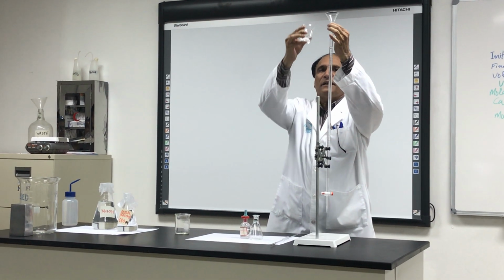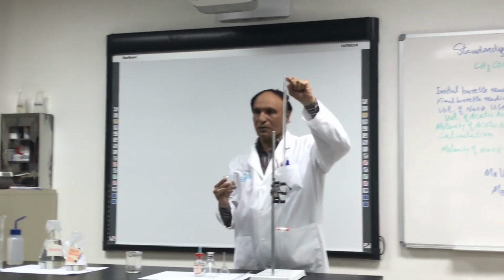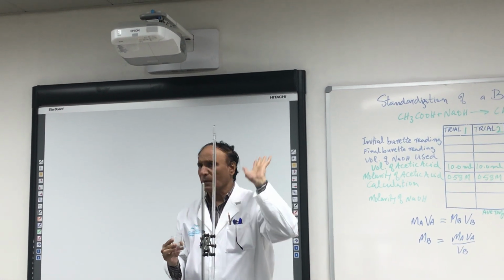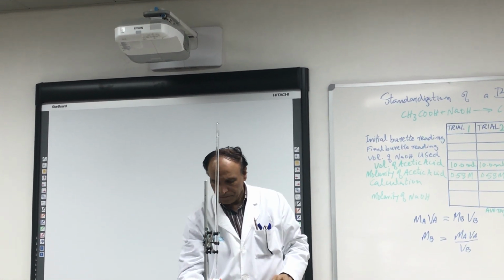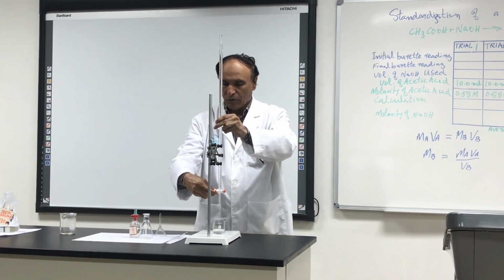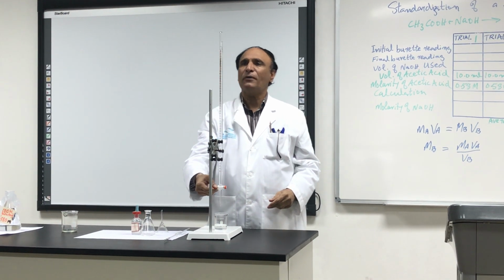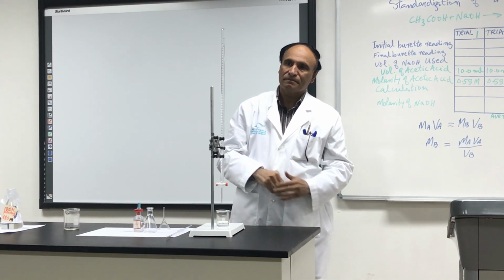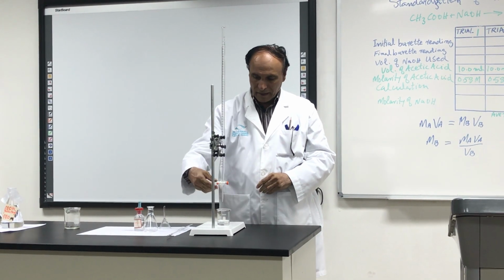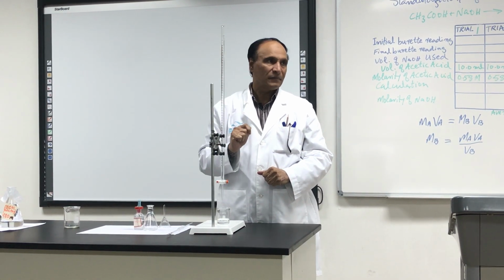For example, you add it above zero. Above zero you add. Yes. For example, even below zero, no problem. And then put the sodium hydroxide over there and open it, and bring it to any point below zero. No need to bring it to zero. Don't waste your time. Any point below zero. Did you understand?